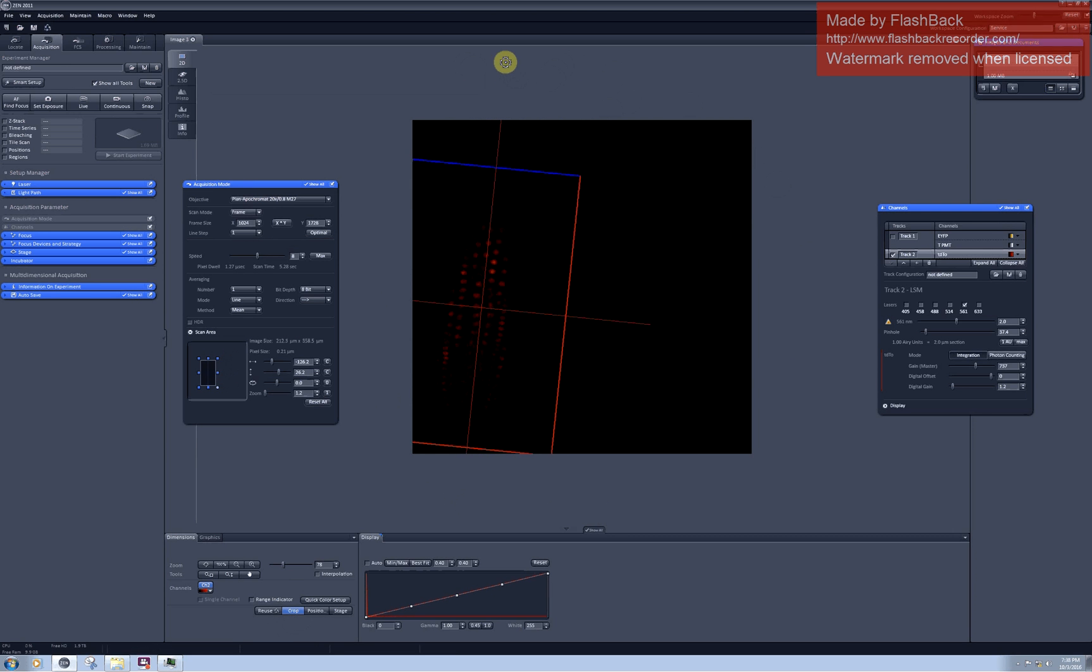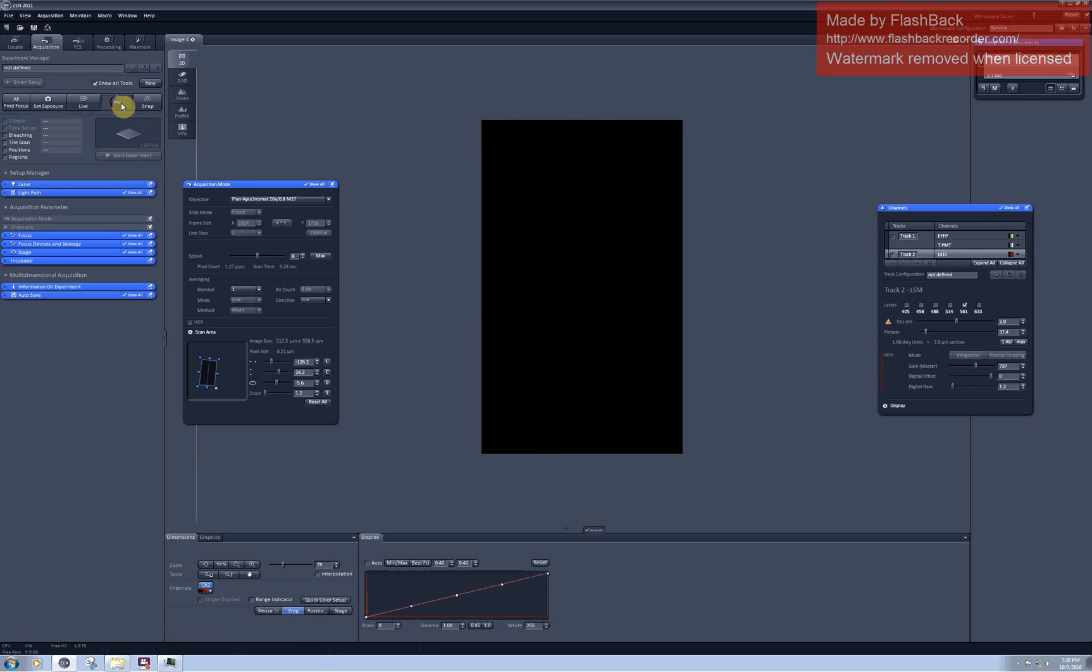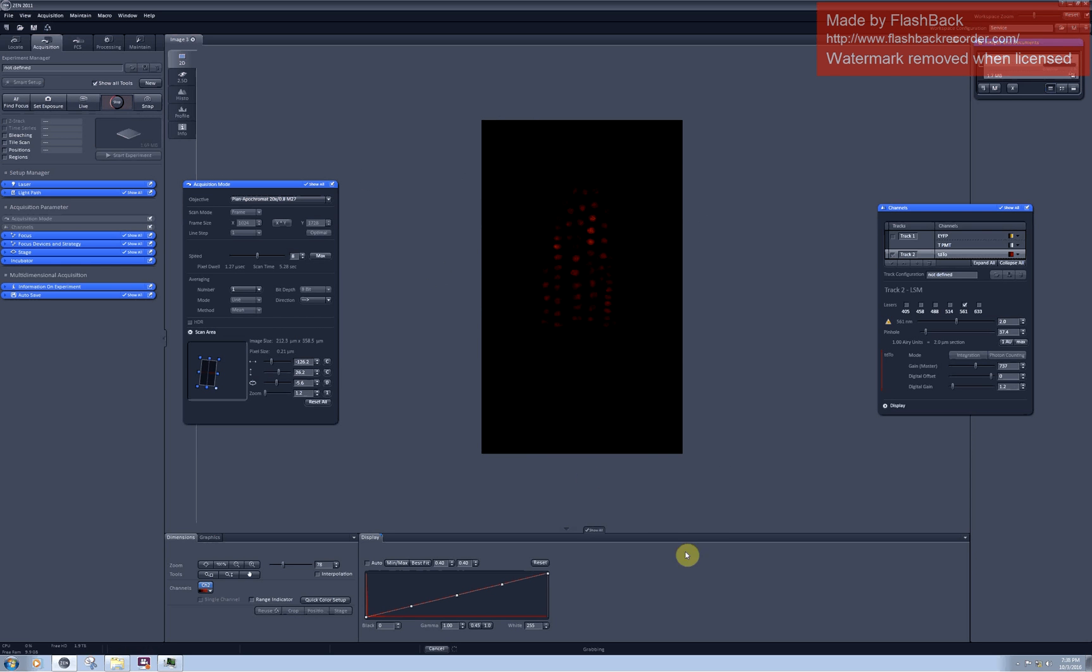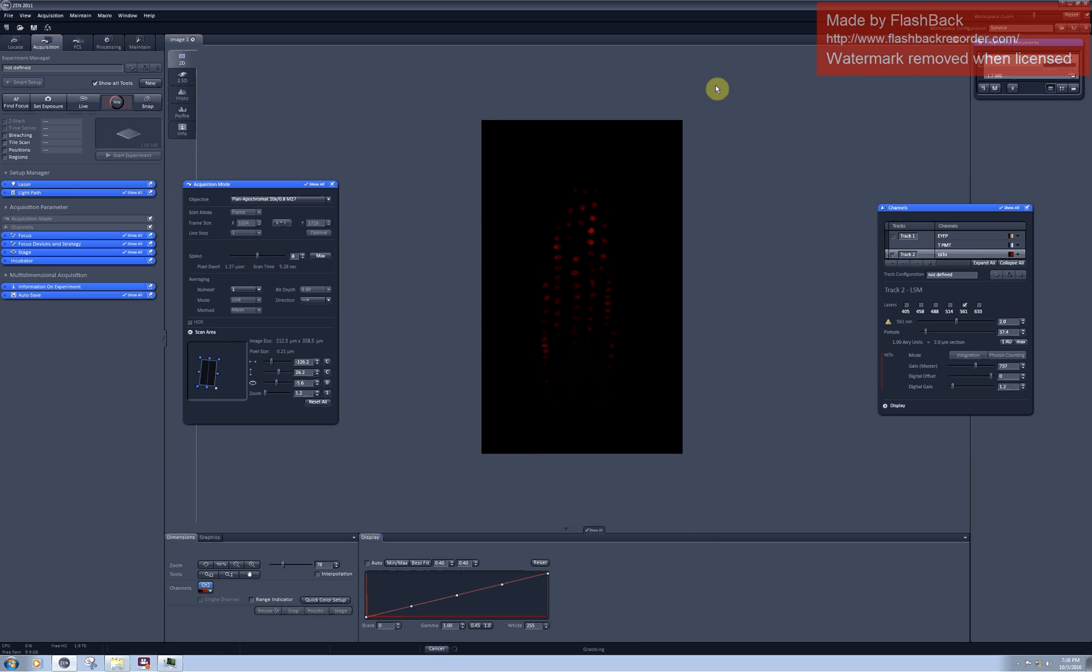I will keep it this way. So when now I click on continuous I'm scanning only the cropped area and this saves me quite a lot of time and preserves also surroundings from photobleaching.